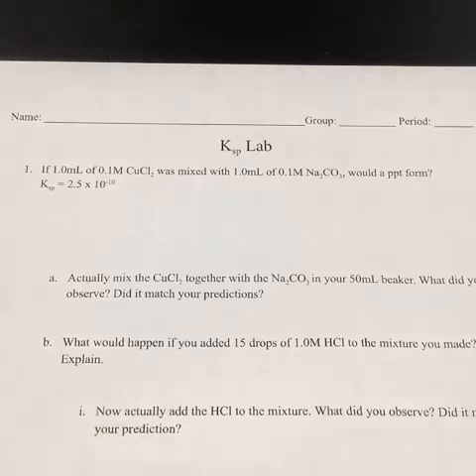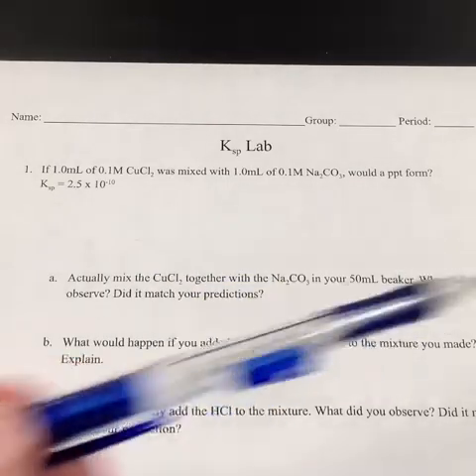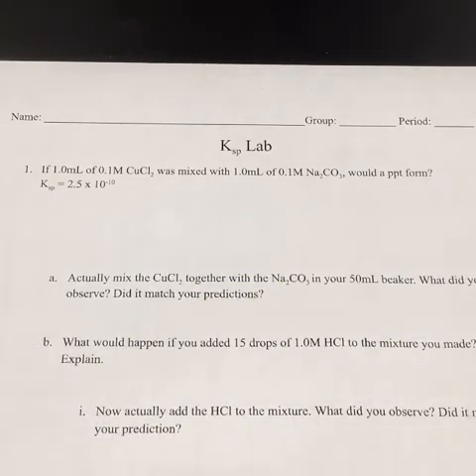So I know that you could technically just cheat your way through this and you could just keep the video running and watch what happens and then make your predictions. But that is really not what we want to see happening, because it's meant to help you for the quiz, it's meant to help you for the test, and really there's no downside to missing it, right? If you go, did it match your predictions? You could say, no, it didn't. This is what went wrong. This is what I thought was going to happen. This is what actually happened, and now I know why. And you're good, right? I'm not going to go slashing your grade on this. So do your best work, make your best effort here, and we'll see how it goes.